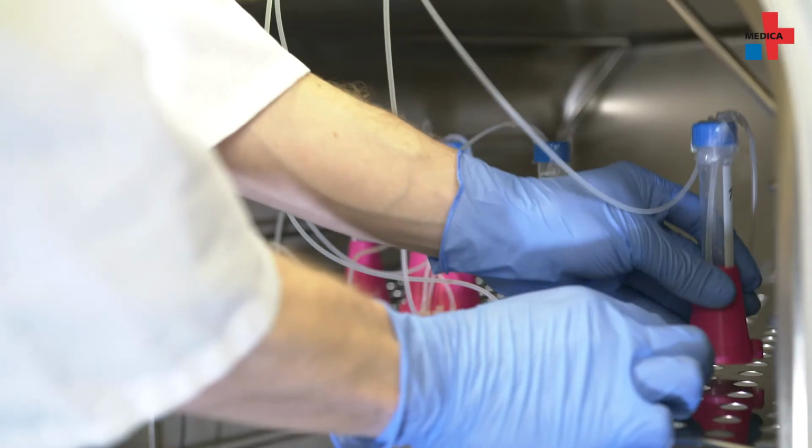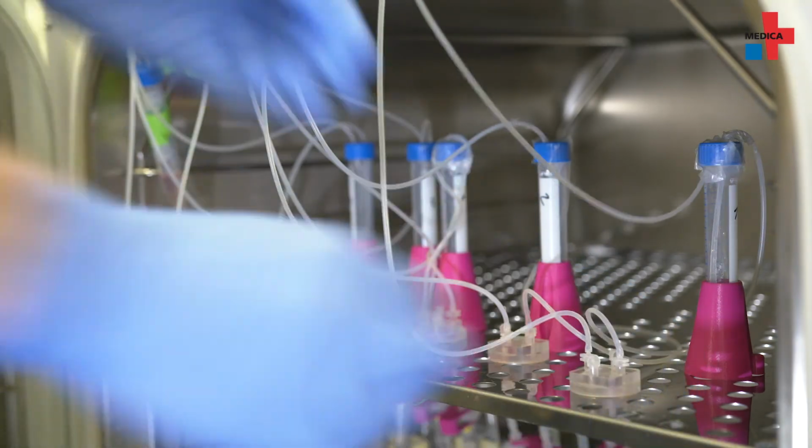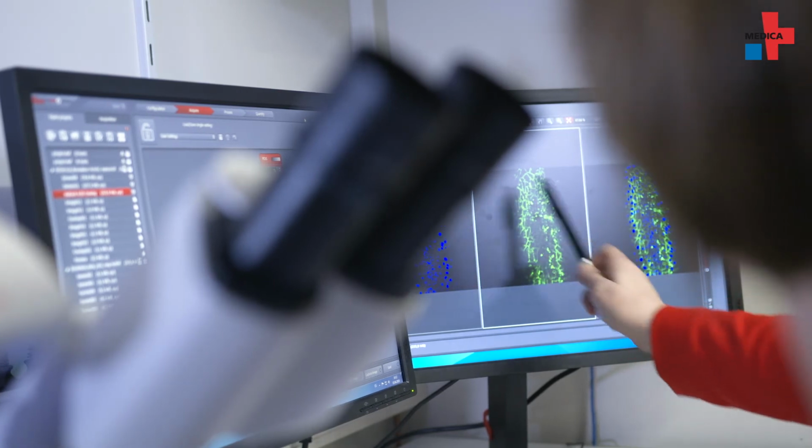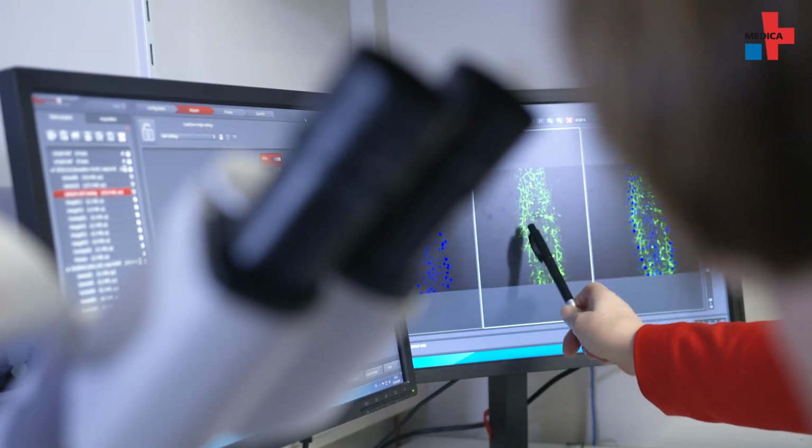We're still in the early stages of qualification and validation studies of chip organs as replacements in pharmaceutical research. It will also take several years before we have complex organs to definitively say that the brain, kidney or liver on a chip reacts exactly the way the kidney acts inside a human body. We still have a long way to go before that's the case.